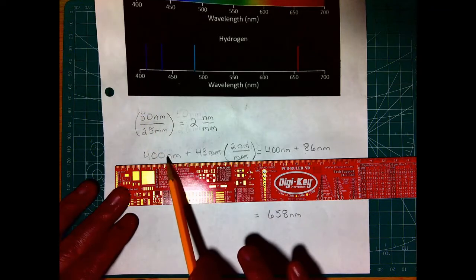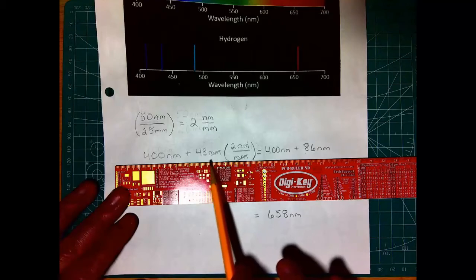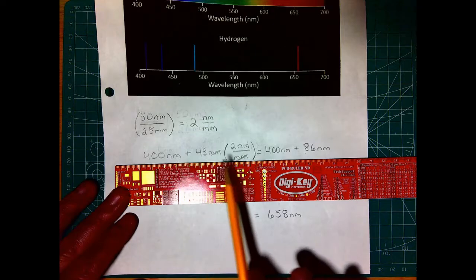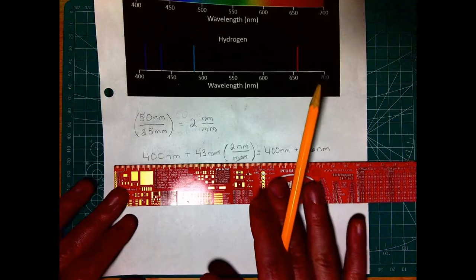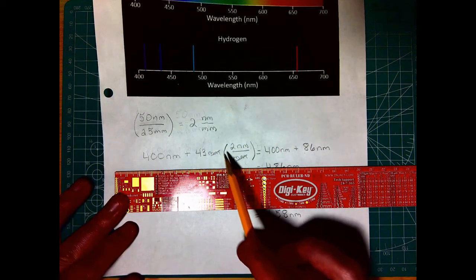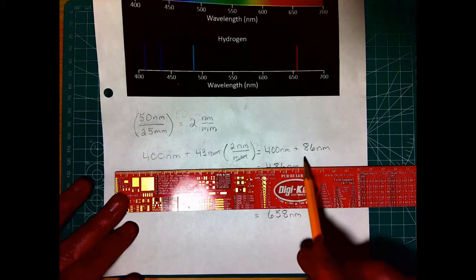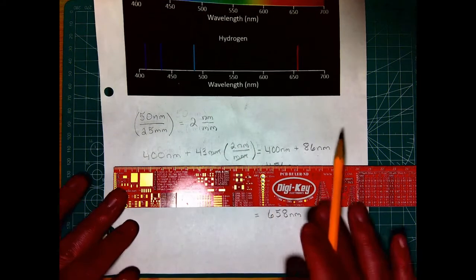We're going to start off with 400 nanometers and add to that our 43 millimeters, but we need this to have the same units in order to add them together, so we use our conversion factor of 2 nanometers per millimeter. We can see then that the millimeters cancel, and we get 400 nanometers plus 86 nanometers.